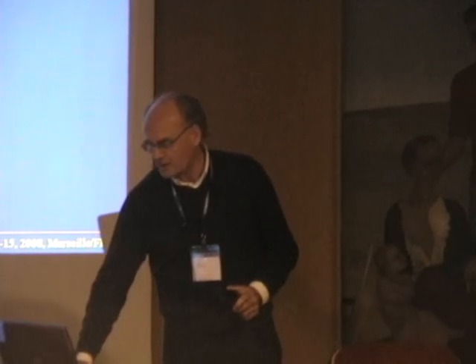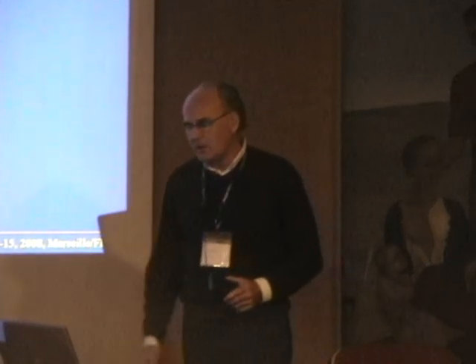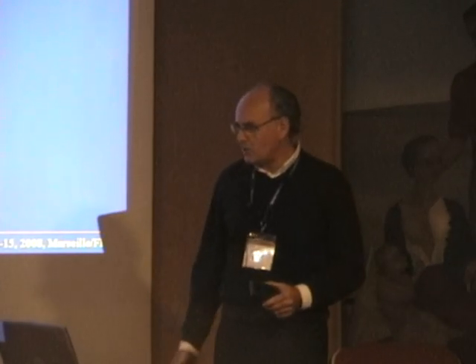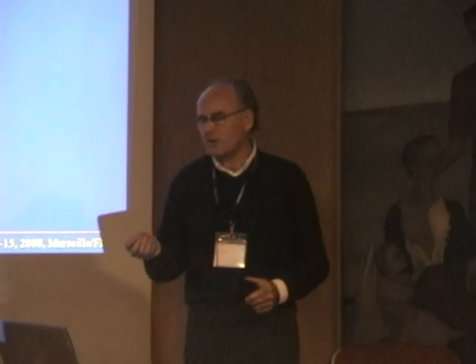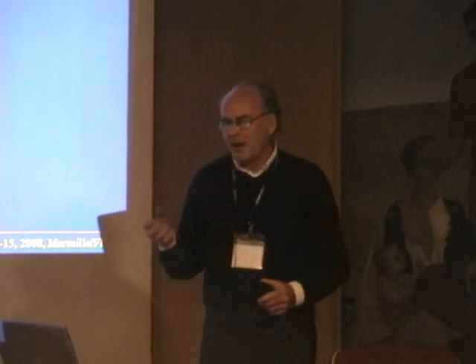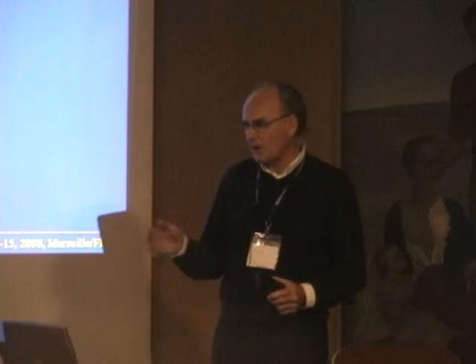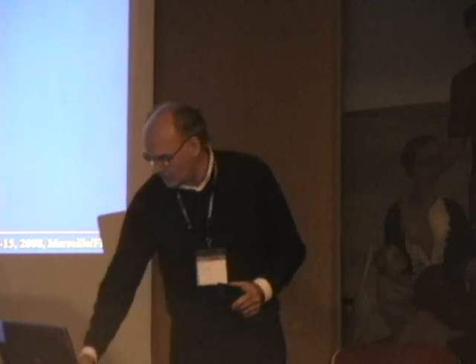So here are a few rationales why you might be interested in doing in vitro instead of in vivo. Well, the first is a practical rationale. There may be some special cases where spectra are not easy to obtain in vivo. For example, if you want to take a spectrum from a tissue region in the brain close to an air-filled cavity, then you may have difficulties shimming this region, getting a homogeneous magnetic field, and so you may not be able to do spectroscopy in vivo, so you may take a biopsy and measure the spectra like that.